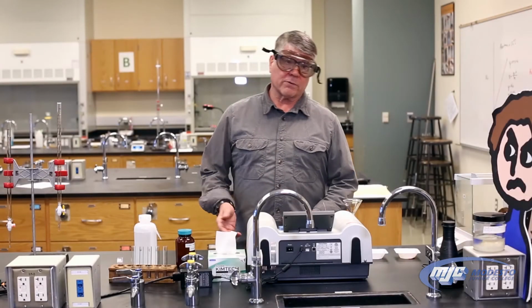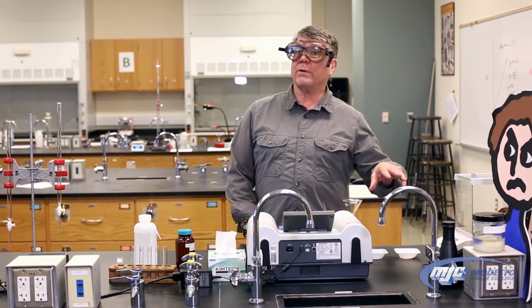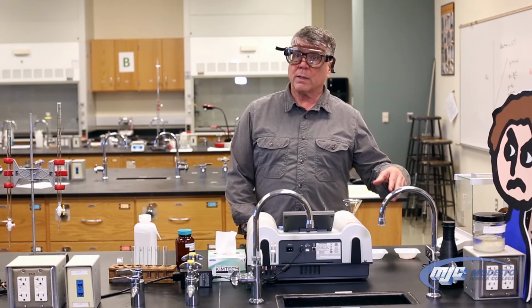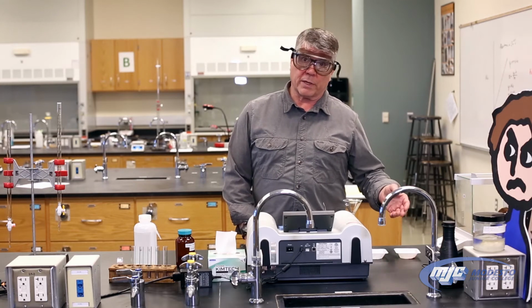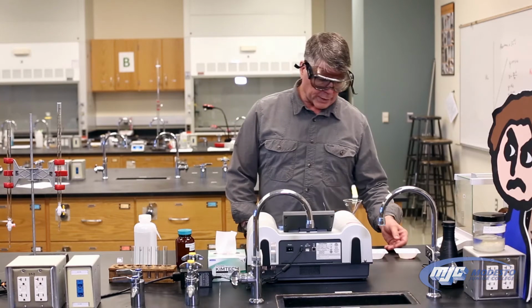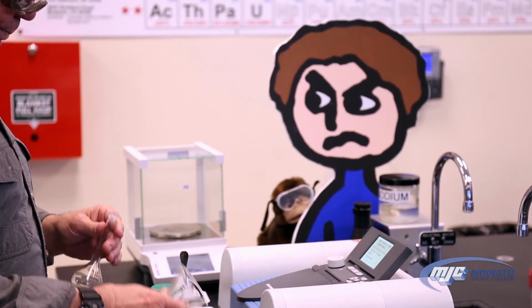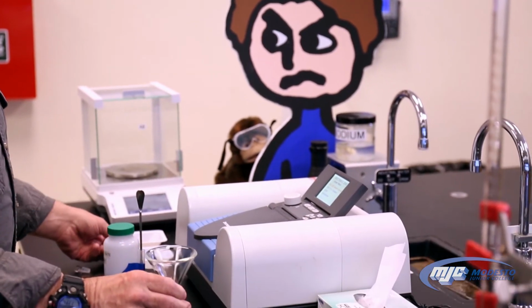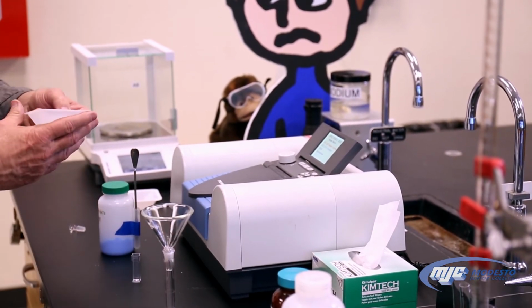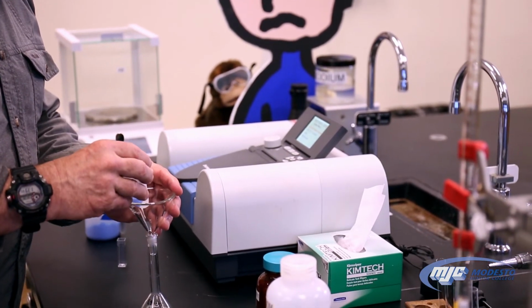All right, guys, so the first thing we're going to need to do is to make up our stock solution. Remember, you figured out already about how many grams of the cobalt 2 nitrate hexahydrate you need and of the copper 2 sulfate pentahydrate. So I've weighed those out already. I'm going to take a 50 milliliter volumetric flask and a glass funnel. Actually it's easier this way: if you first add the copper 2 sulfate pentahydrate, it goes in pretty easily.